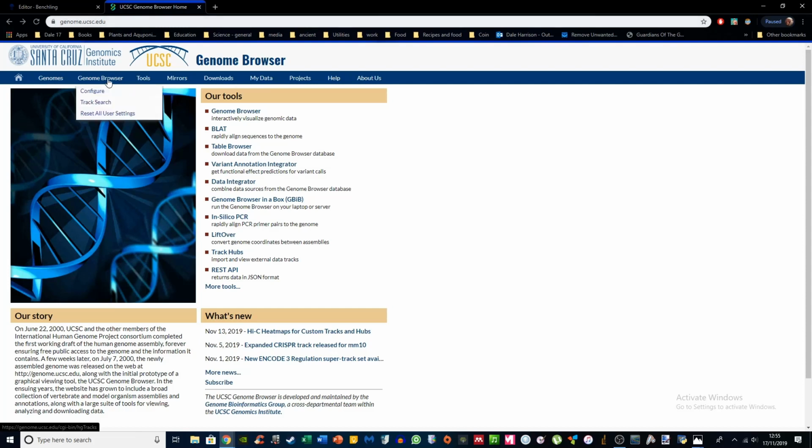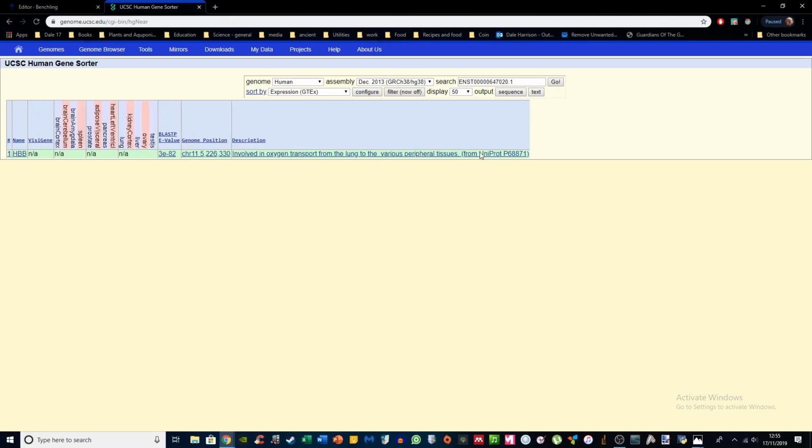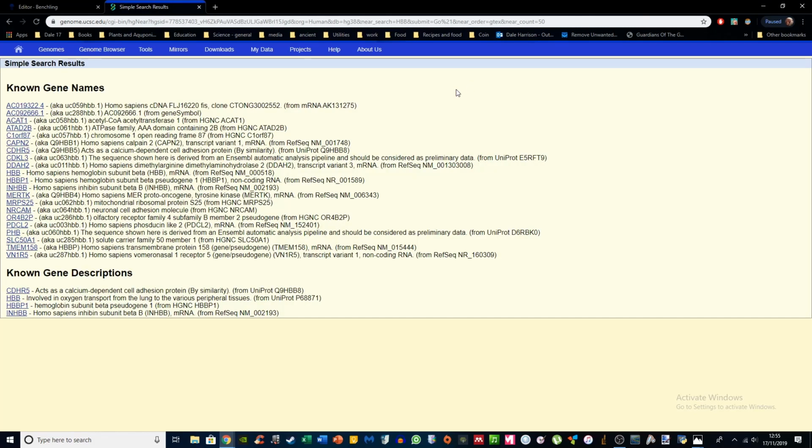So what I want to do is go to the tools, and here there should be a gene sorter. There we go. So I'm going to click there. And then what we're looking for is the human beta globin beta subunit. So we're going to type in HBB and hit enter. And then we find it in this list. There we go.